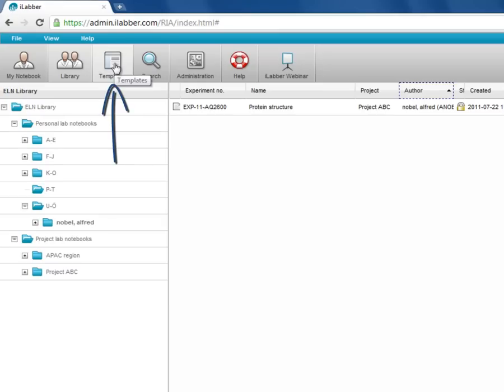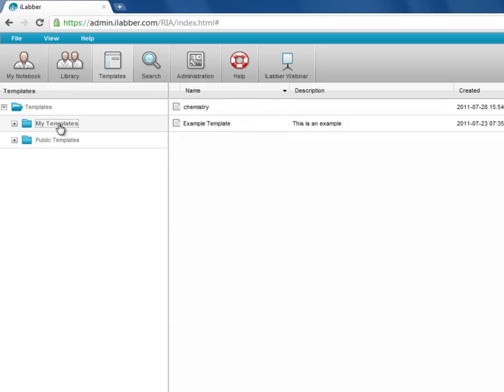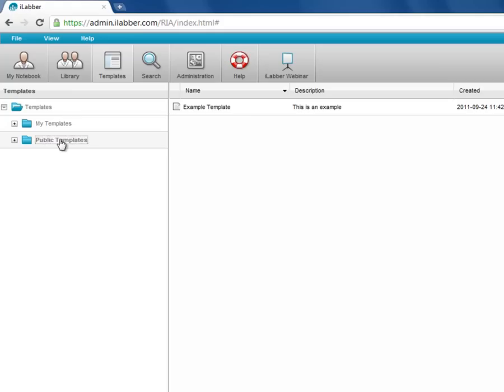The third button is templates. Here you can create a new template, but you can also find your old templates if you need to edit them. You have your personal templates which you can just double click to open, and there are the public templates which you can also open and edit if they belong to you.